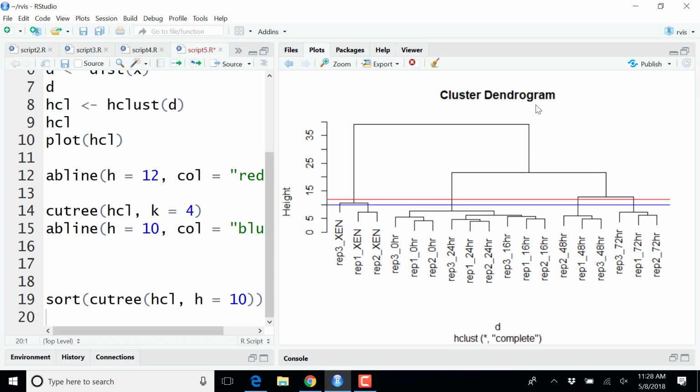But ideally, really, when you do something like that, you might want to, well, first of all, think carefully, what do you want to display? Are you interested in correlations or not? Have you scaled your data or not? Have you normalized your data? And then maybe you might want to try different clustering methods and to see whether some of the clusters that you see are stable.